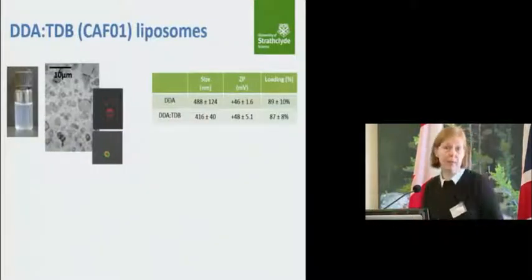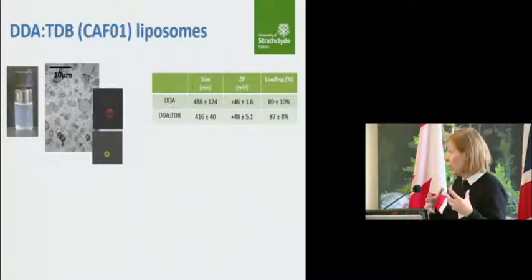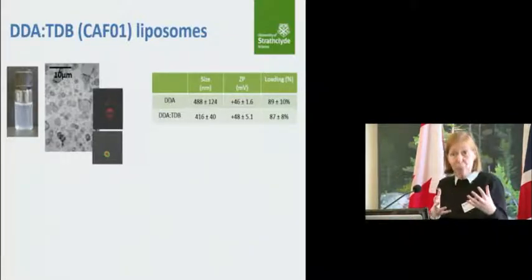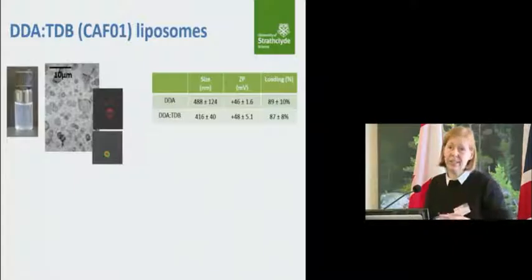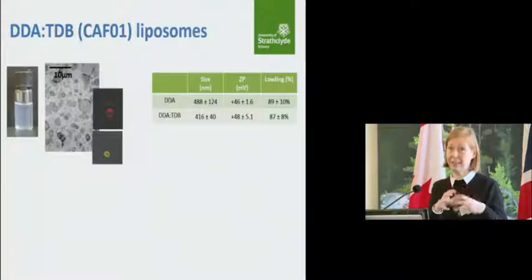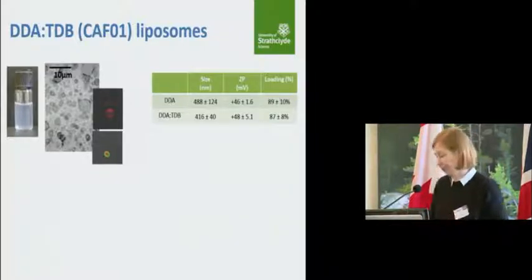We've been working with this cationic formulation for a while. You can make it by the standard lipid hydration method. When you make it, it's around 500 nanometers if we don't process it any further. It's obviously very positive in charge because of the DDA component, around 50 millivolts, and because of that, we work with subunit antigens that are negatively charged. It's very easy to stick the antigen onto the surface through electrostatics, so it's a very easy loading system. We can see that here: we stained the liposome bilayer in red, and the antigen is stained with green fluorescent protein, and you can see the dual system.